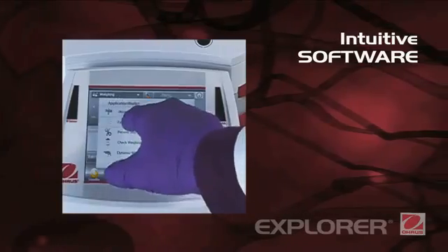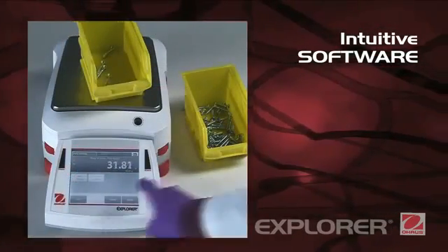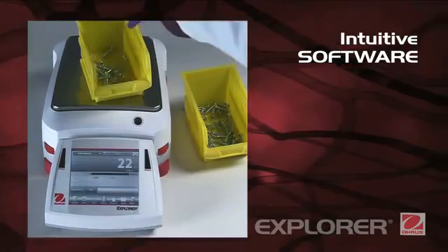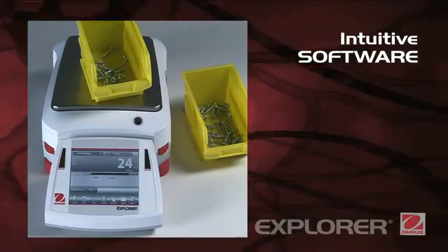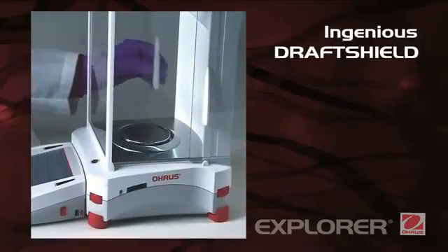Intuitive software. SmartTex 2.0 is Ohaus's easy-to-use graphical software featuring 14 applications, QWERTY and numeric keypads, and minimum weight indication.